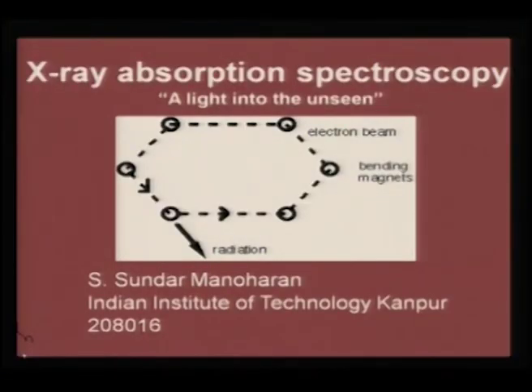This is popularly called X-ray absorption spectroscopy, and it is also complementary to the information that we get from X-ray photoelectron spectroscopy, which we saw in the previous lecture.